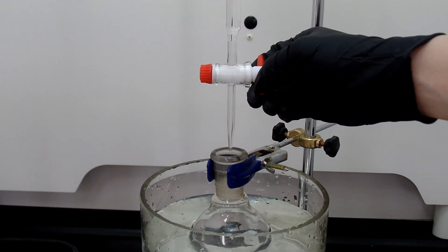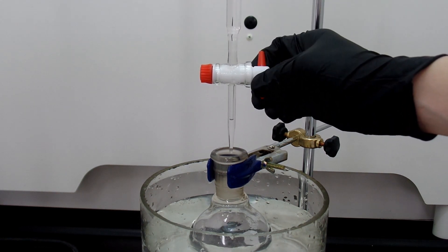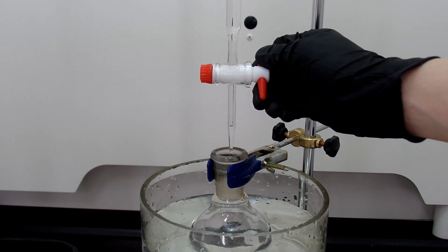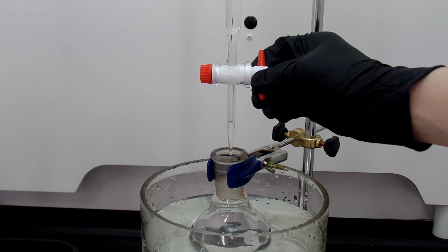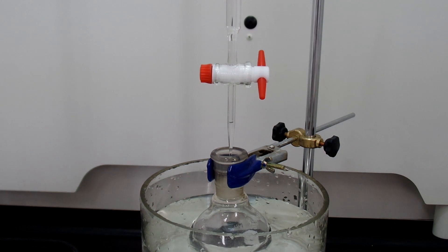Into the flask, add 14.4 grams of 1-propanol drop wise. This reaction is extremely exothermic and you should add it slowly. This is the reason why we set up the ice bath. Addition takes a pretty long time, so don't forget to replenish the ice bath.